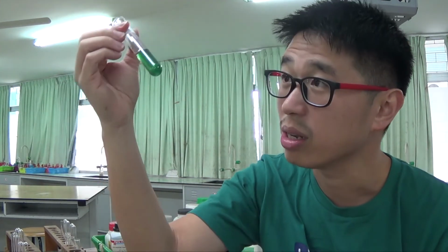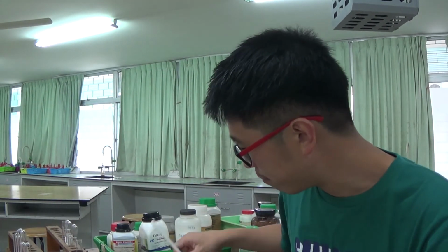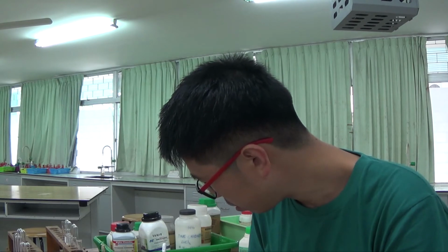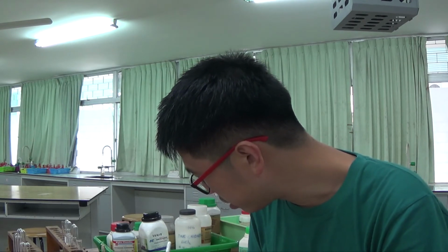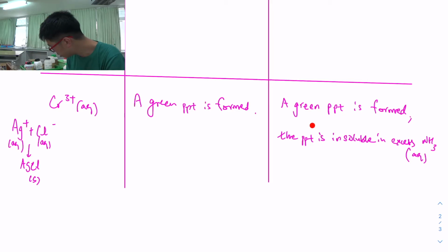I'm afraid it's not very easy to see, but when I added a very small amount of sodium hydroxide, you could see at the beginning just now, if you rewind the video, that you obtain a green precipitate. But what is different? Iron 2+ has the same result with both NaOH and NH3.